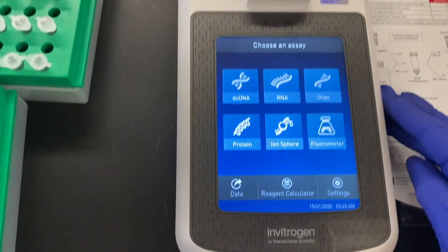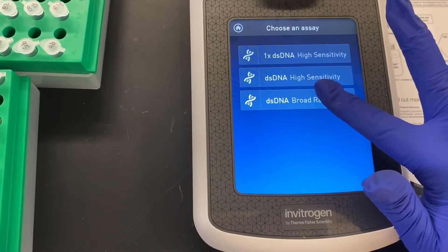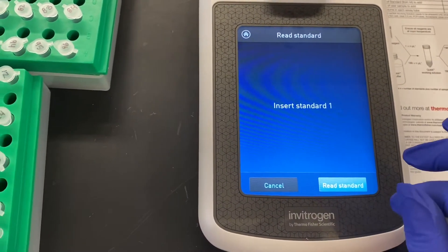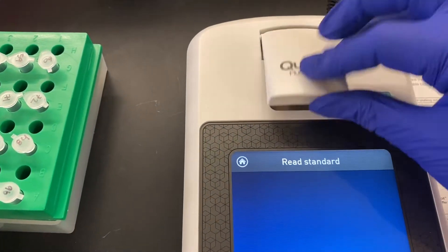Since we are using the broad range double-stranded DNA kit, we'll select the dsDNA option and then dsDNA broad range. It'll prompt you to either read a sample or new standards. Each time you're running a Qubit, especially with a new working solution, you always want to read in new standards.